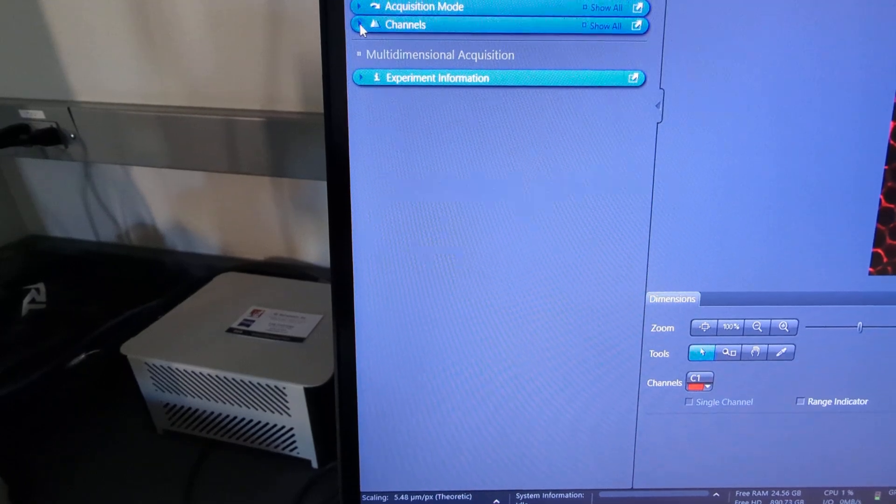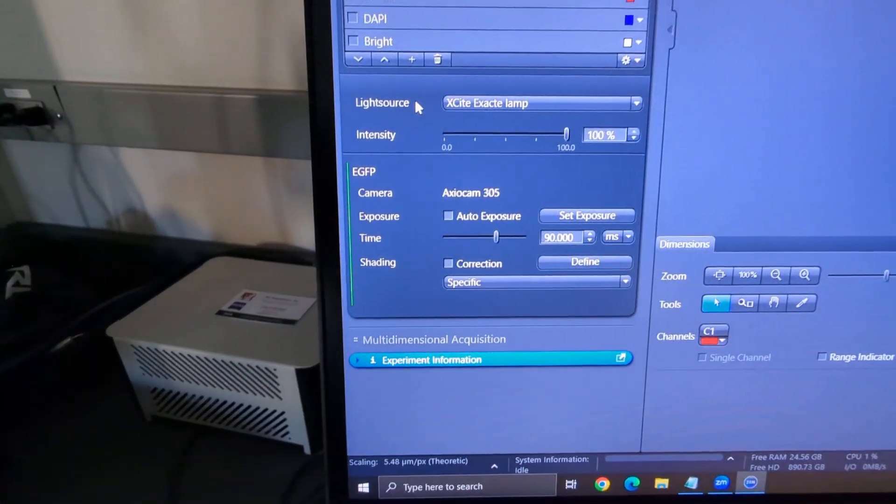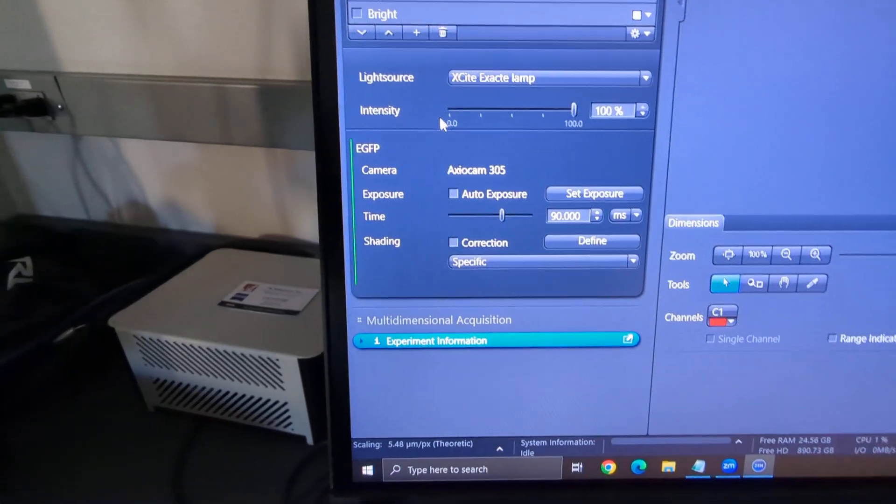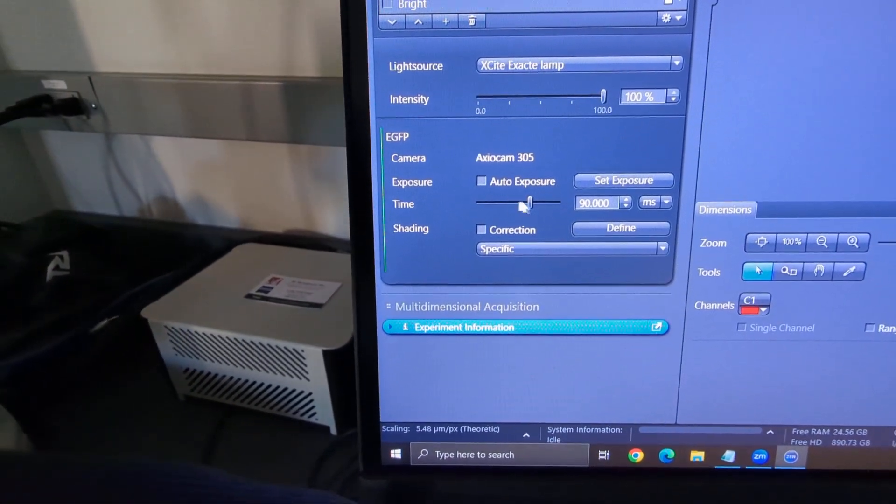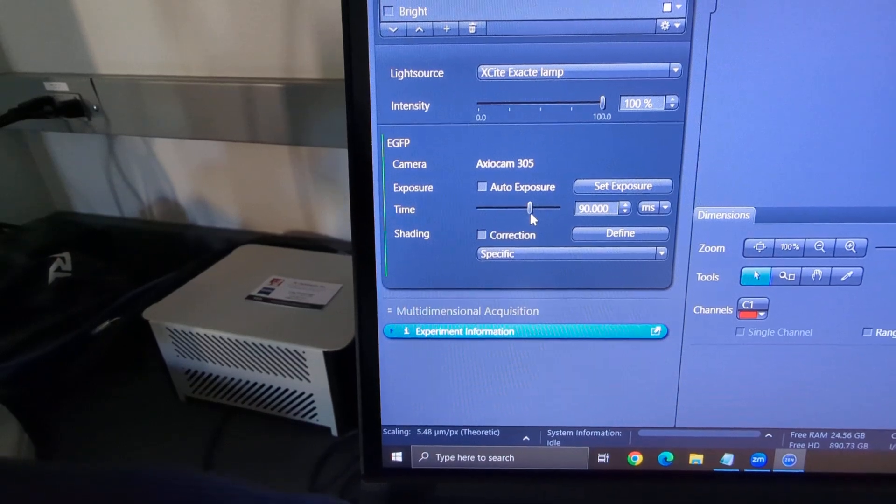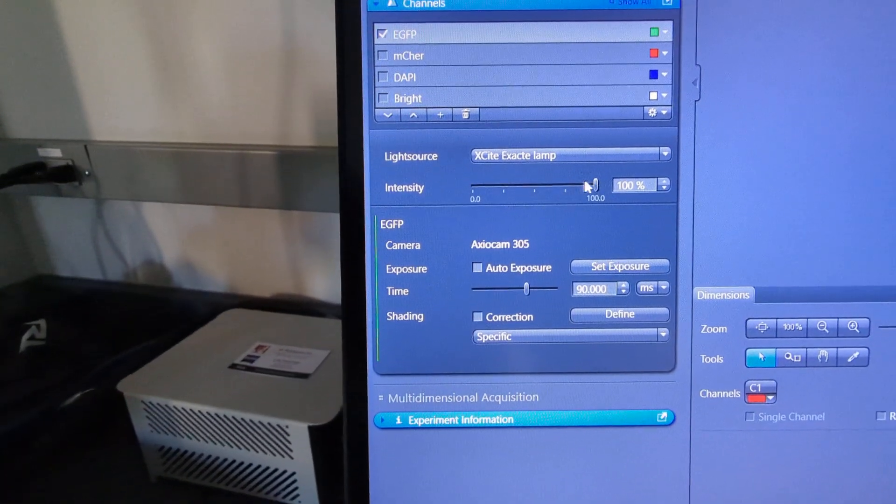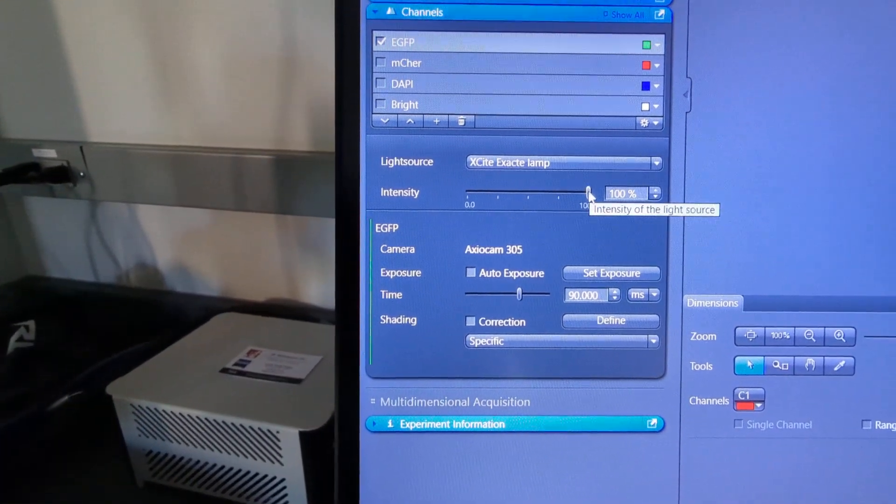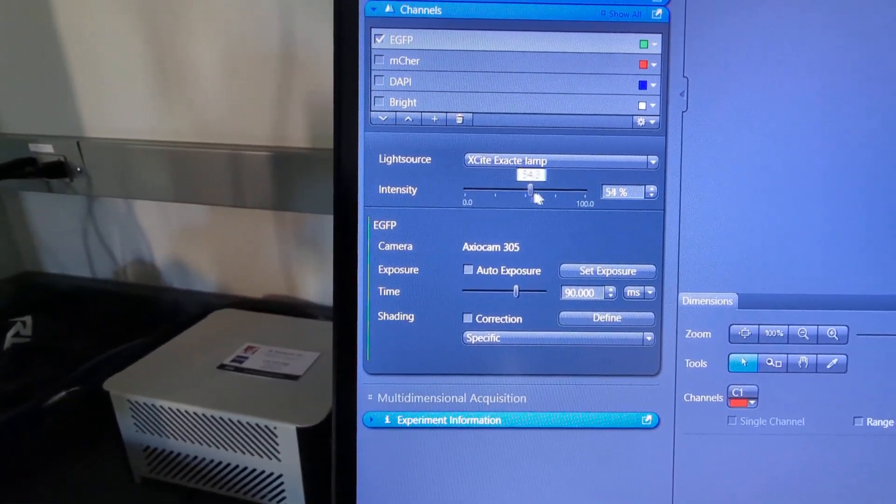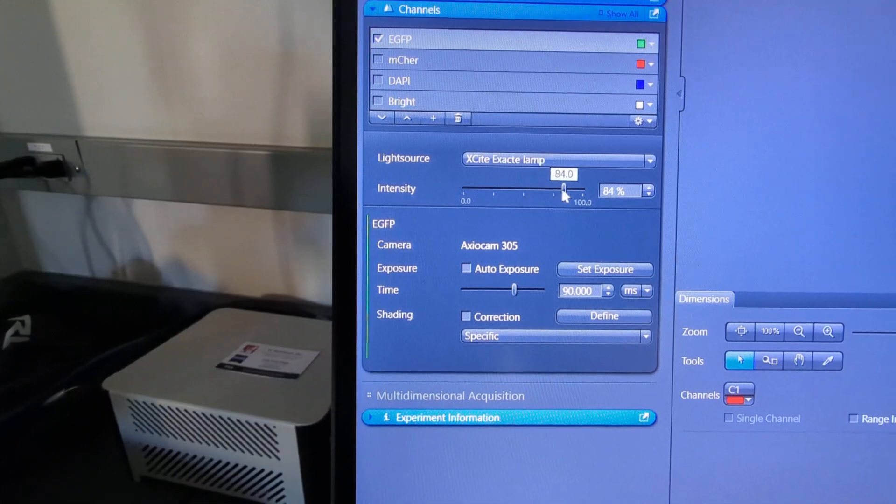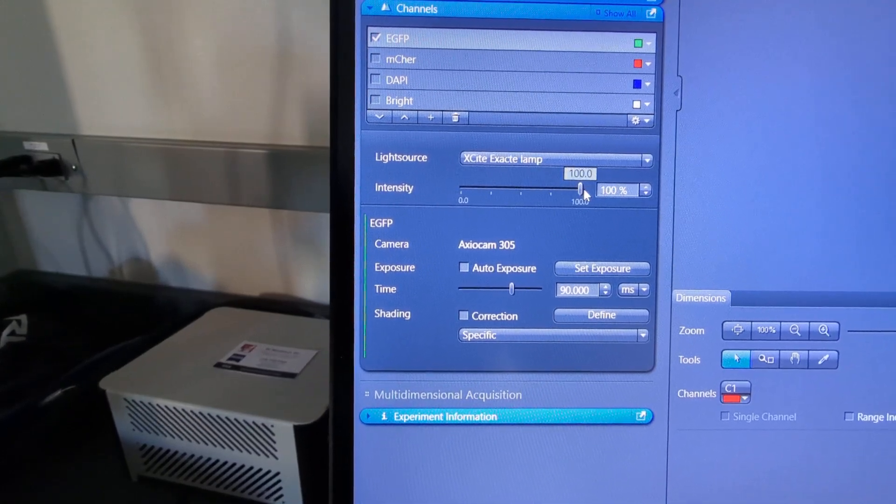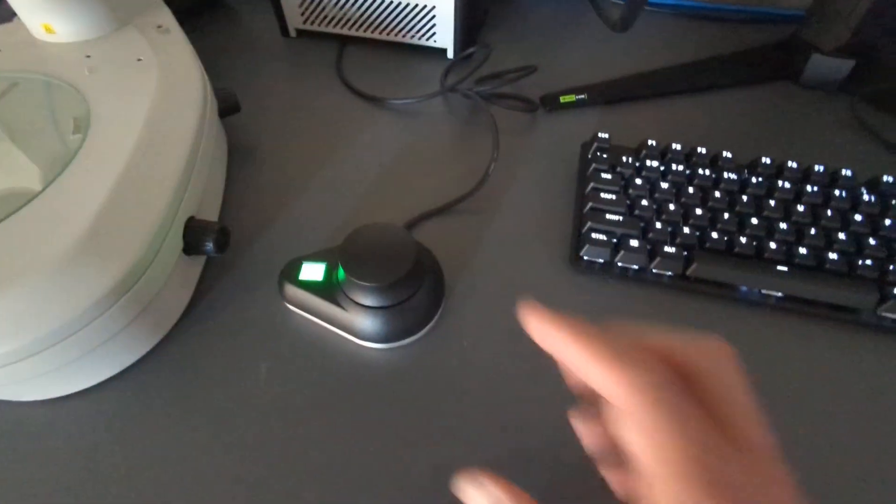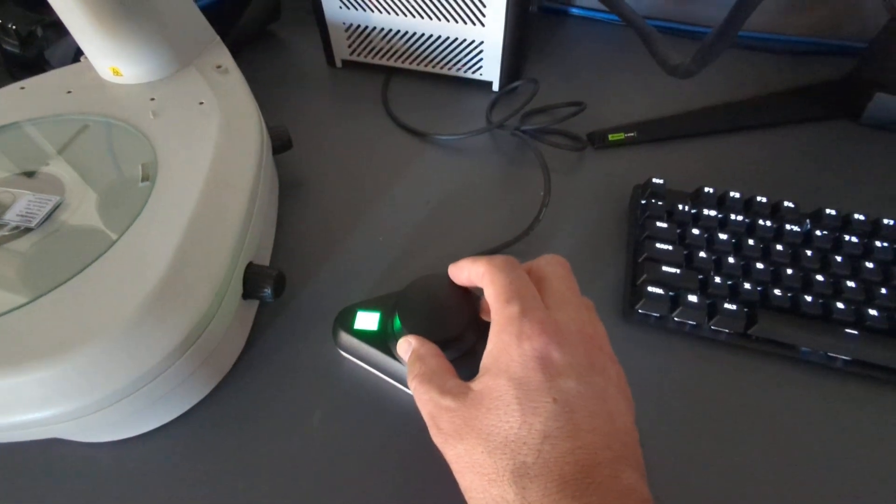But you'll also notice another feature here, this is the excitation lamp, so your fluorescence light can be adjusted here just like it can on this controller.